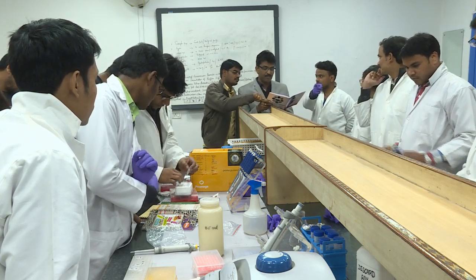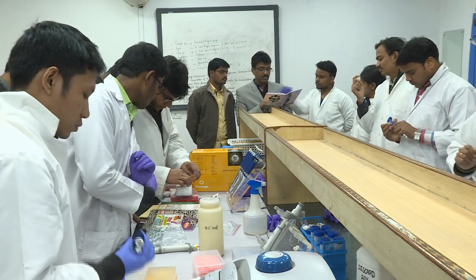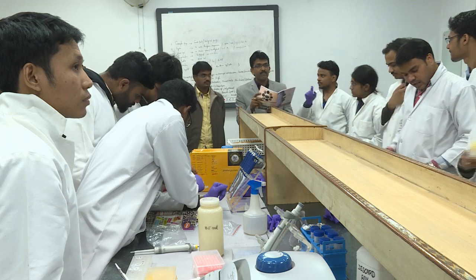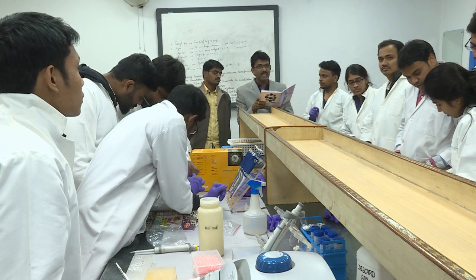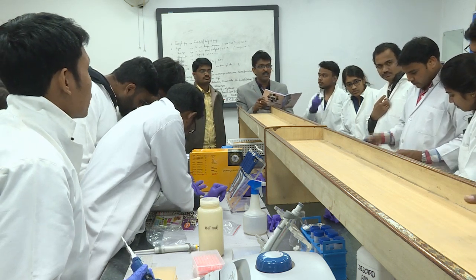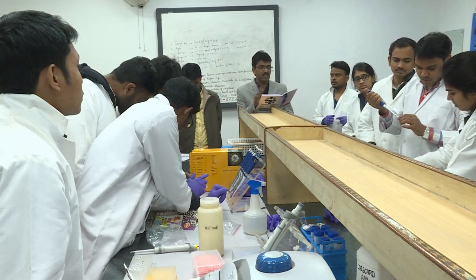Okay. PCR, whatever PCR is running now. Yeah, 260 to 280 ratio also, it's very good, 1.79, and the other one is 1.53. That is slightly on the lower side. Okay. Now you set up PCR. PCR is for this sample only. Okay, with ITS and 1 and 4. So that means 2 PCRs are going on here, right? Bacillus also? No Bacillus, only this sample. Okay, fine. All right, I got it now. So 4 samples need to go for PCR now in 2 machines.